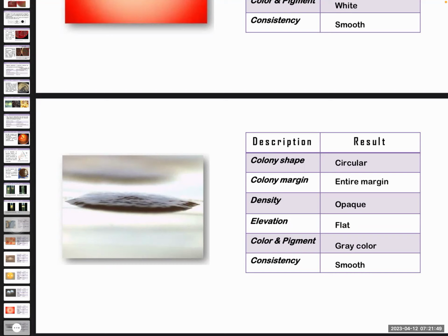Or sometimes they also tell us na, ayun, convex colonies, ganyan. Depending din naman sa SOP ni laboratory. But again, they only describe what they can readily tell. No need to identify the margin, mga ganyan, consistency, etc., etc. Okay, how about last here?